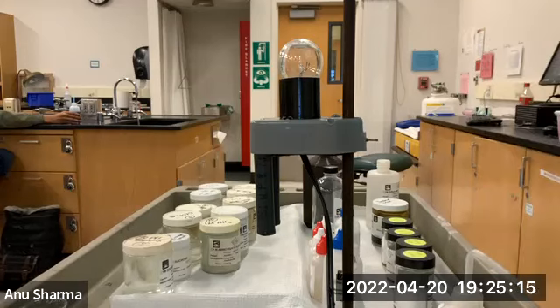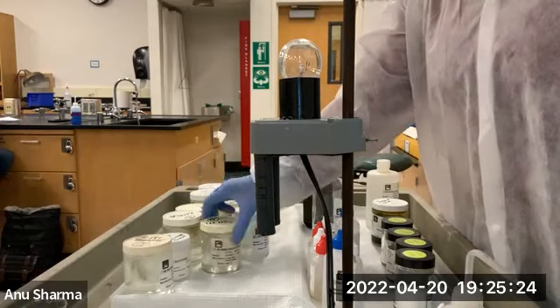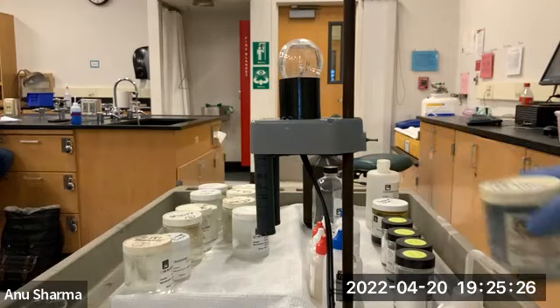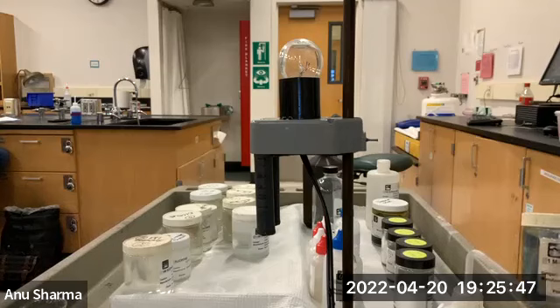Okay, they didn't give us the NaOH, but NaOH will also ionize, strong ionization in fact. Okay, let's look at next, ammonia. Sorry, number 11 is not available. So you can just write down, it's a strong electrolyte. It will 100% ionize. The major species is going to be Na plus 1 charge and OH minus 1 charge. Okay, and then minor is none.